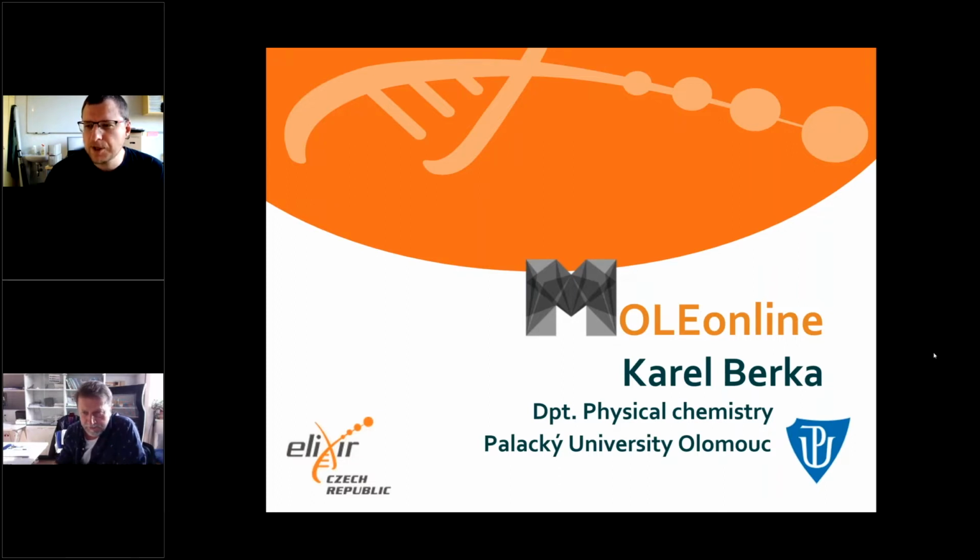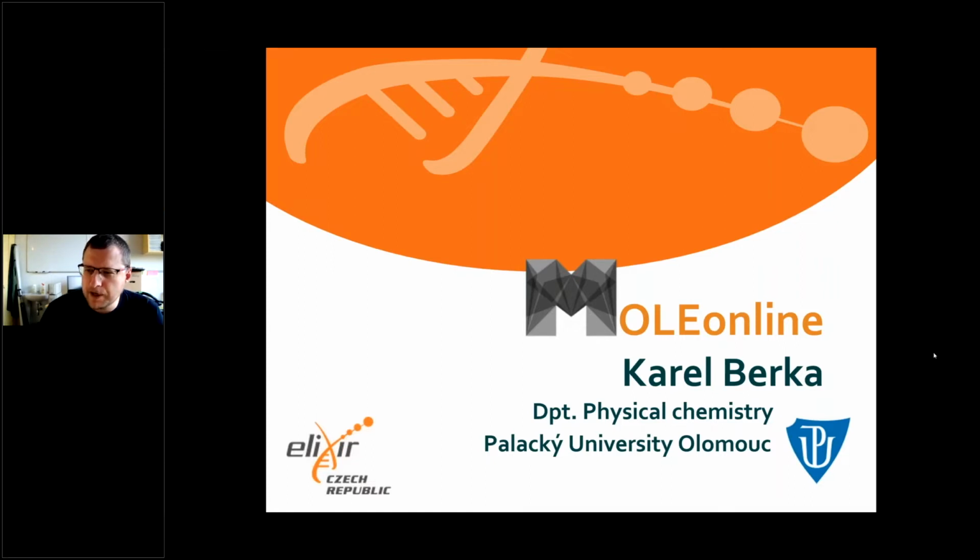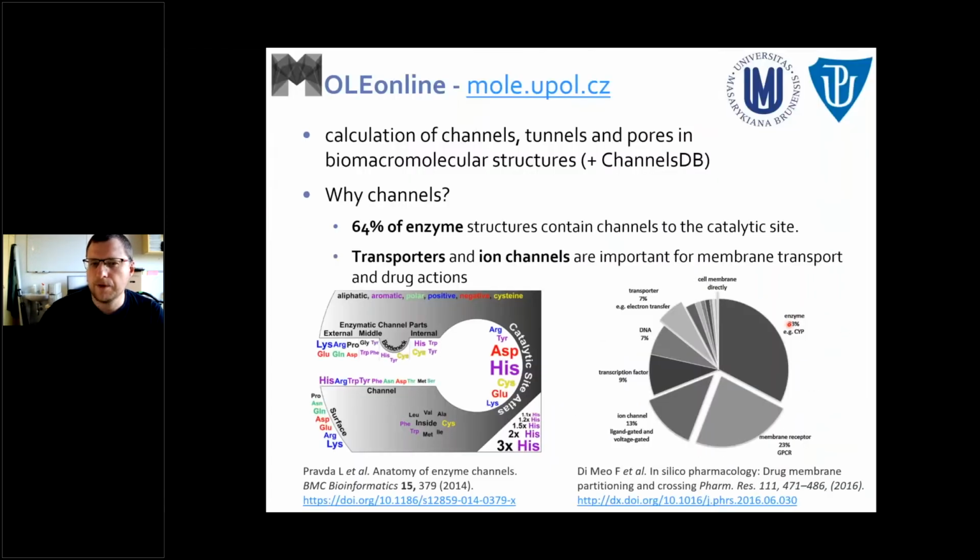Good morning, ladies and gentlemen. My name is Karel Berka, and I will be speaking about Mole Online, which is our tool for the analysis and calculation of channels, tunnels, and pores in biomacromolecular structures and storing them in ChannelsDB.